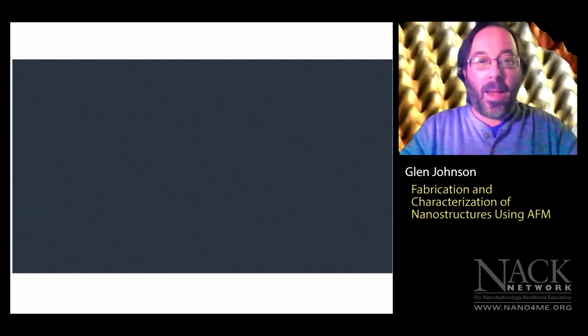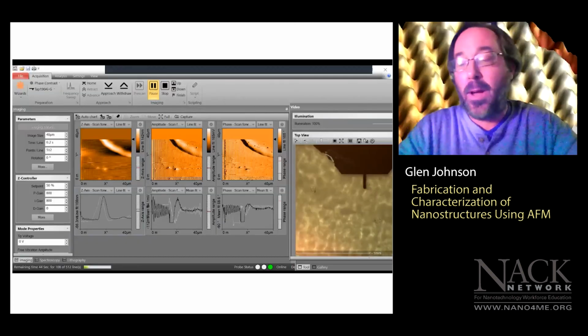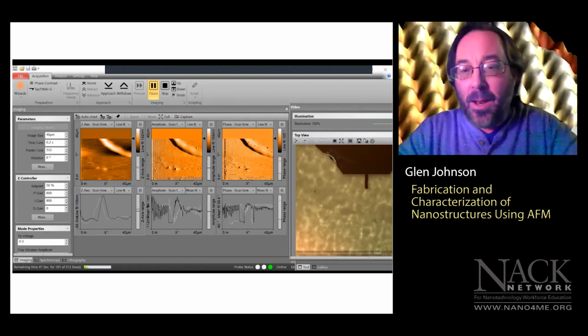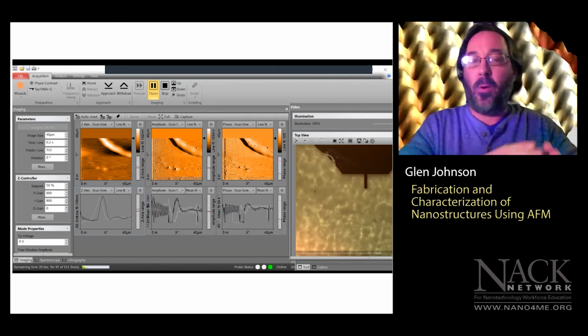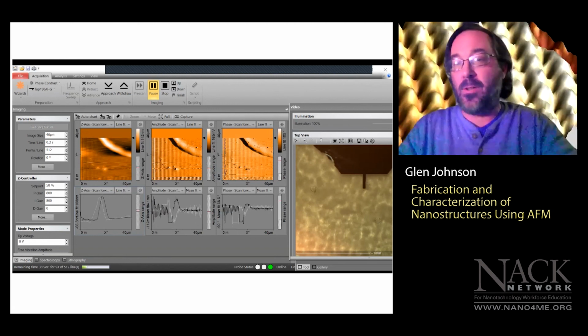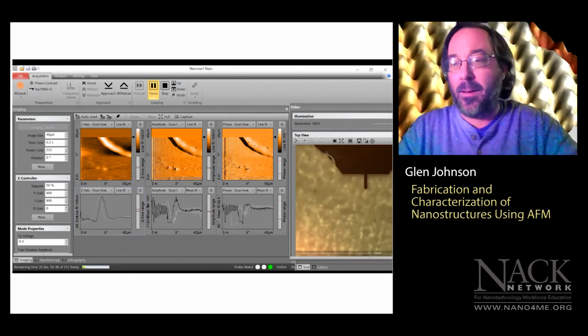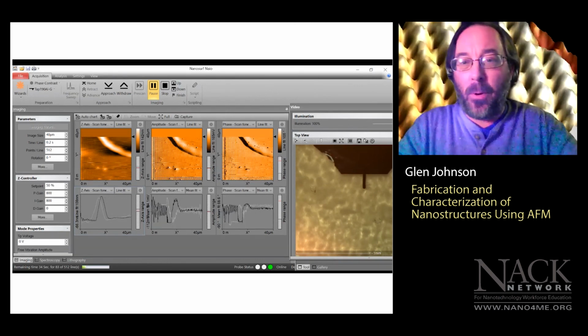And let me go ahead and bring it back to the microscope because it hit something big on here. So again, we're hitting some feature on here. So you can kind of, again, tell that difference between what topography looks like and what phase looks like. I think it looks like it just might be some PVP that got kind of piled up.